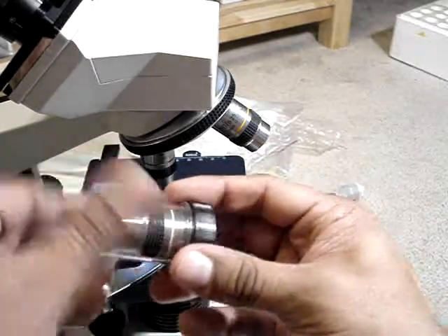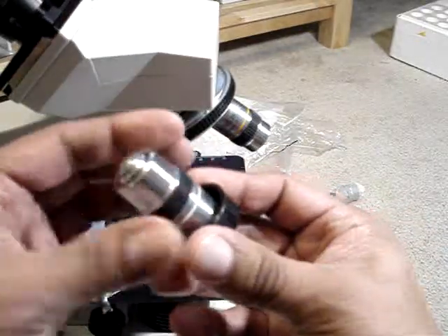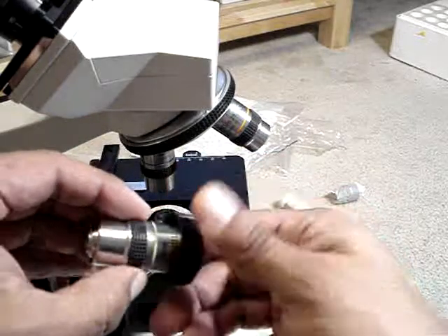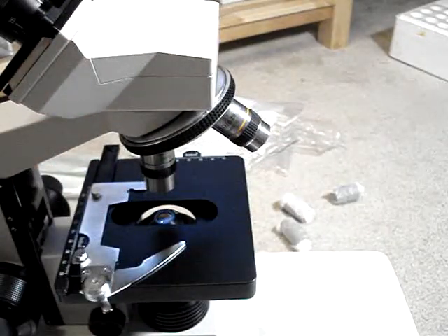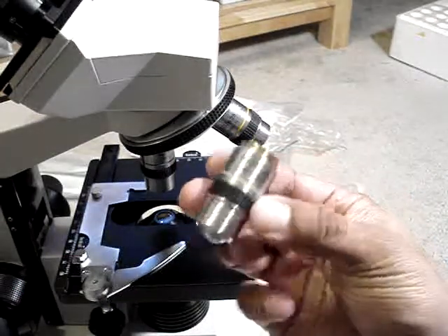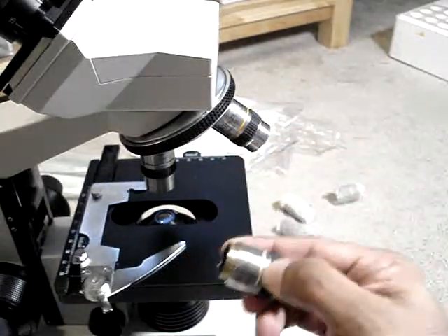I'm not sure if they make a special T adapter to connect your digital camera with your microscope, but I know they make a T adapter for telescopes. If you want to do astrophotography, I would assume they do, and if they do, maybe I can put up some pictures.